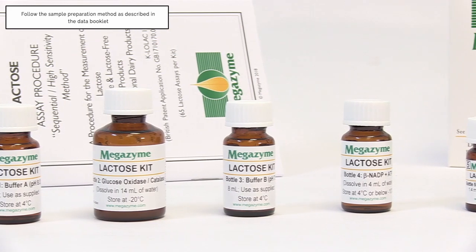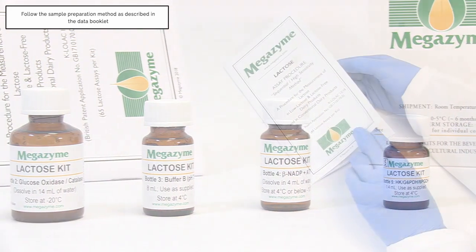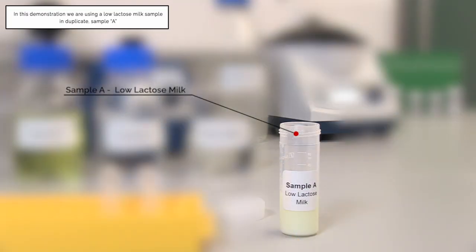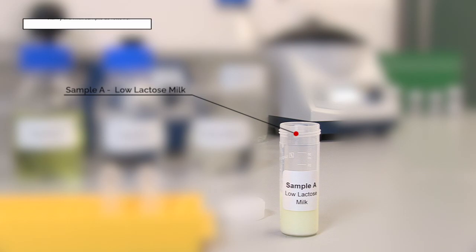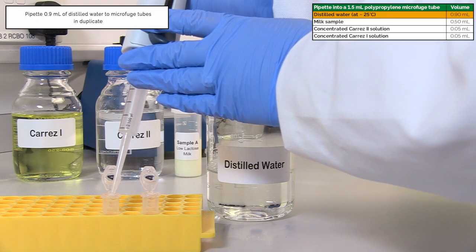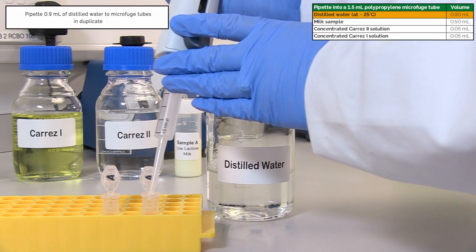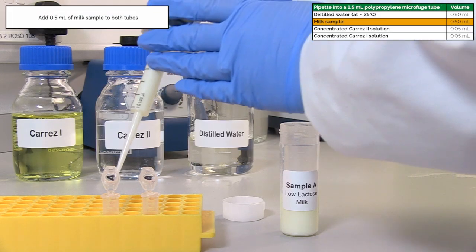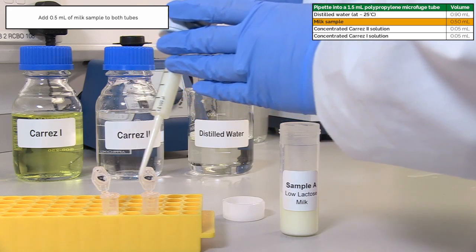Follow the sample preparation method as described in the data booklet. In this demonstration, we are using a low-lactose milk sample in duplicate, sample A. Clarify the milk sample as follows. Pipette 0.9 milliliters of distilled water to microfuge tubes in duplicate. Add 0.5 milliliters of milk sample to both tubes.